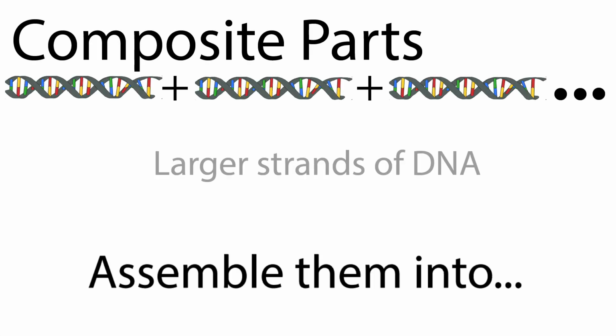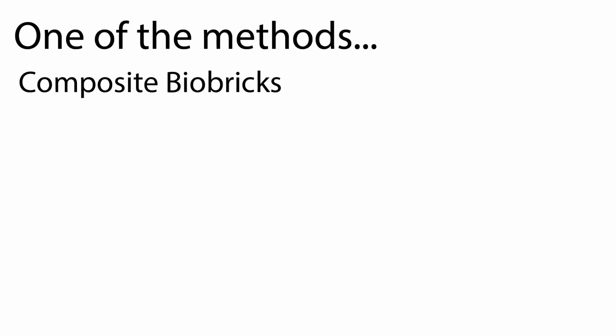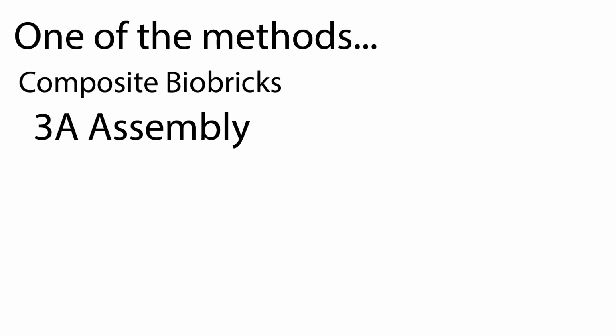To combine these basic parts to form a function, we must assemble them into what is known as composite parts, which are larger strands of DNA. One of the methods to assemble the basic biobricks into composite biobricks would be the 3A assembly.